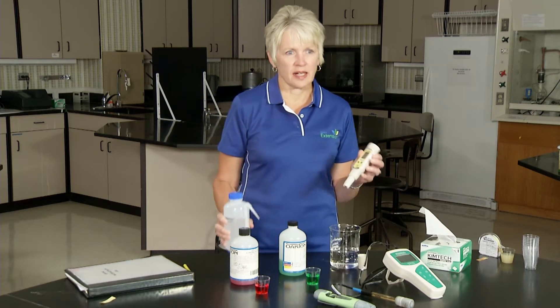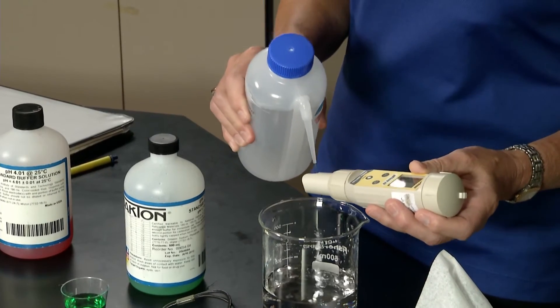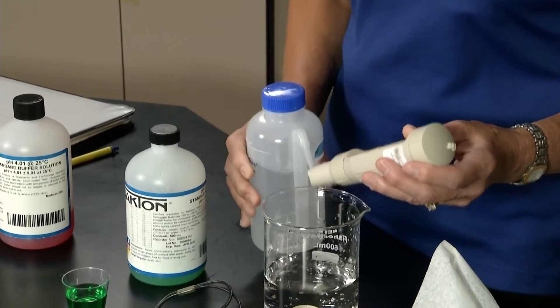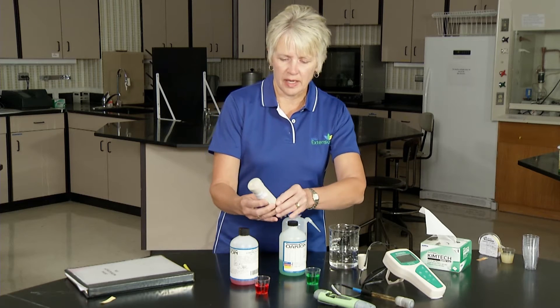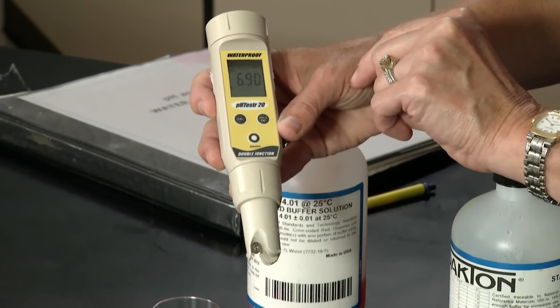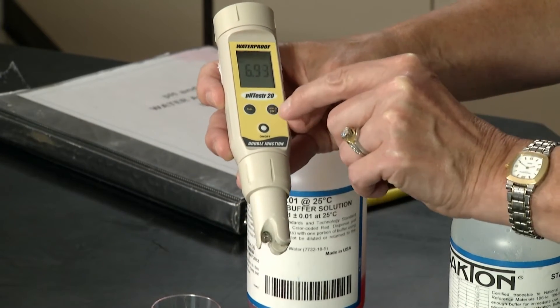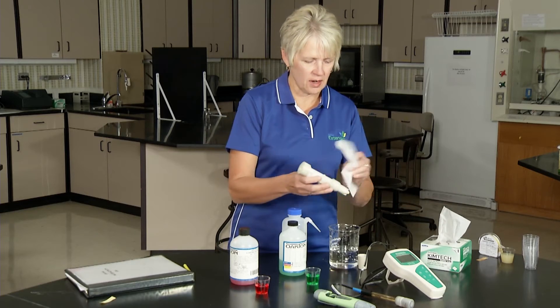Always look at the directions that come with your meter and be familiar with what you need. To begin, we'll rinse this off and look at the display panel. We turn it on and right now this display panel is in measure mode — it says M-E-A-S on the display panel. We press the Cal button and we now have it in calibration mode. We rinsed it off.